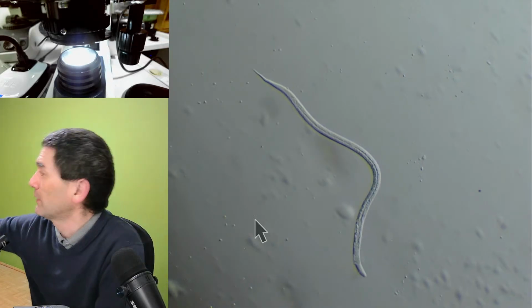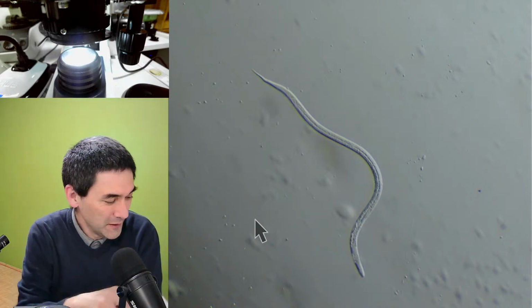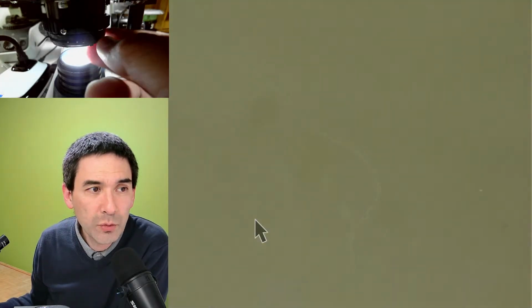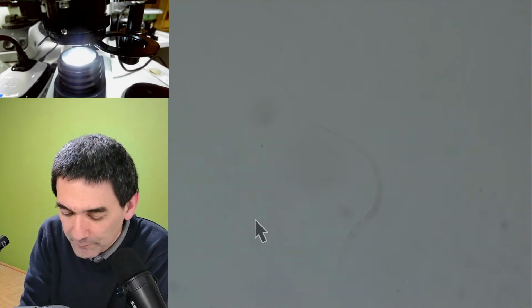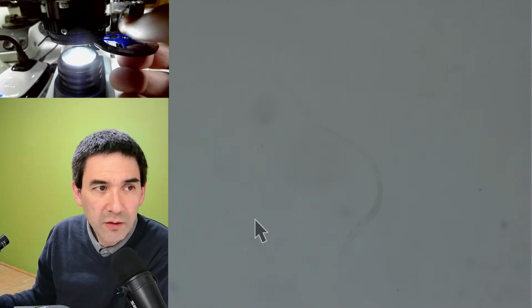Thank you very much. Okay. Your questions are here, right? So let's do the following. Let's try the following. I'm going to now try the, how do you call it, the blue filter again. Where is it? Let's see how the blue filter works.